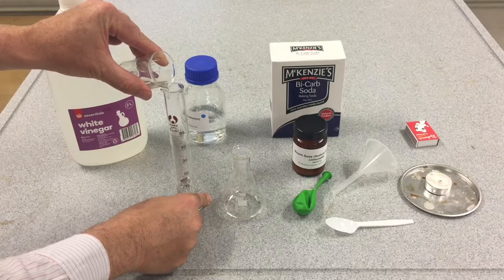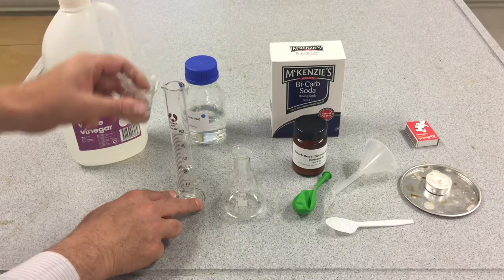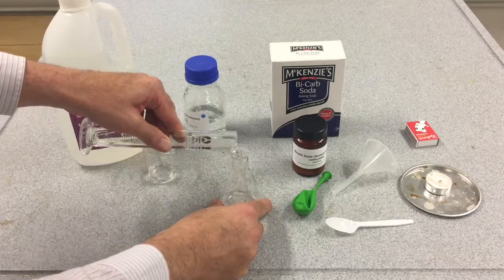So you need to go carefully in this step to make sure you don't go too far up the measuring cylinder. Once you have your 20 mils, pour that into the small conical flask.